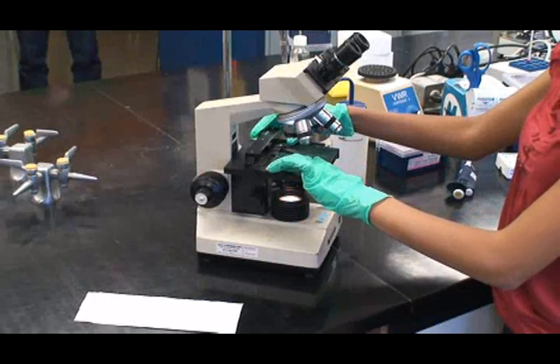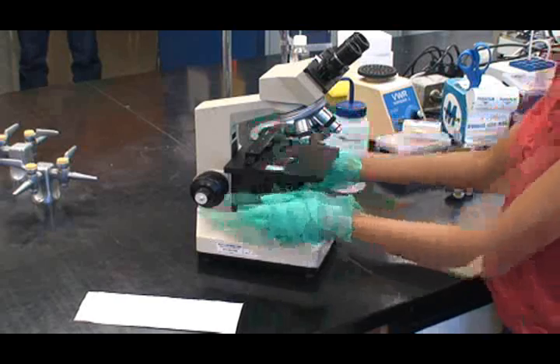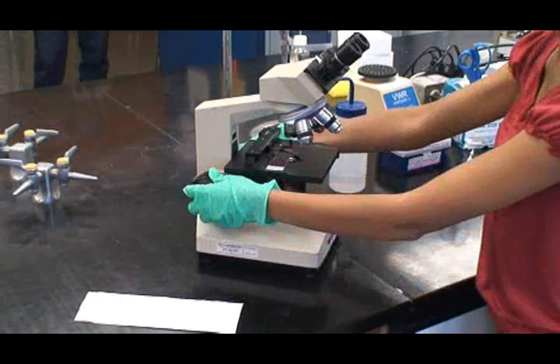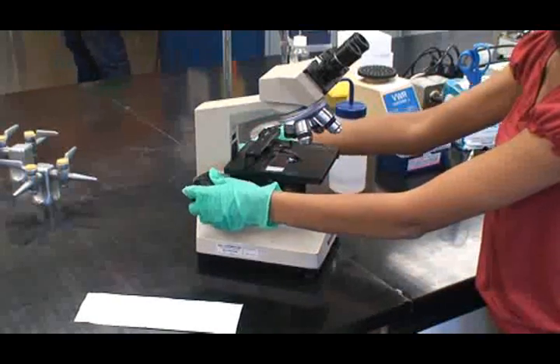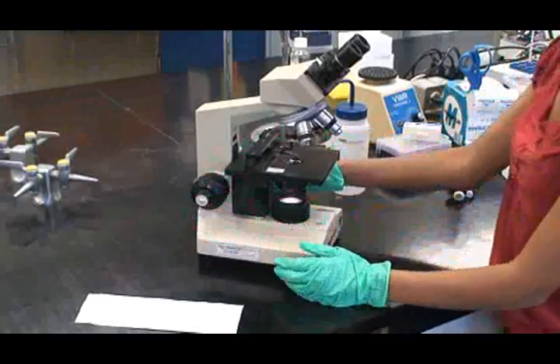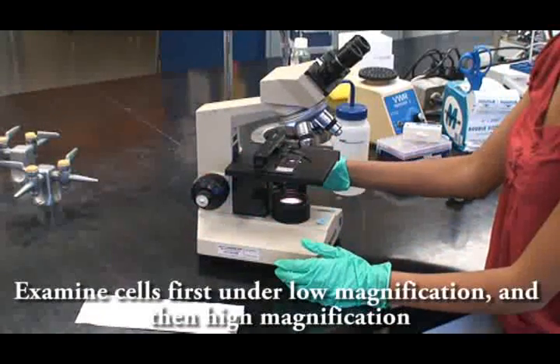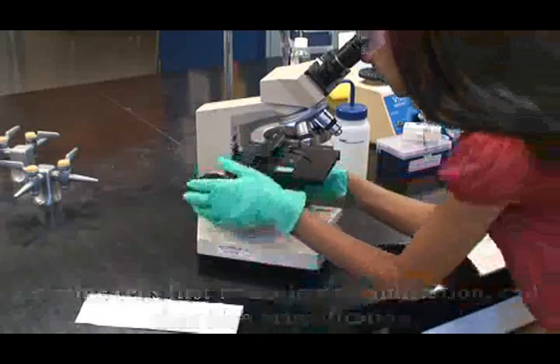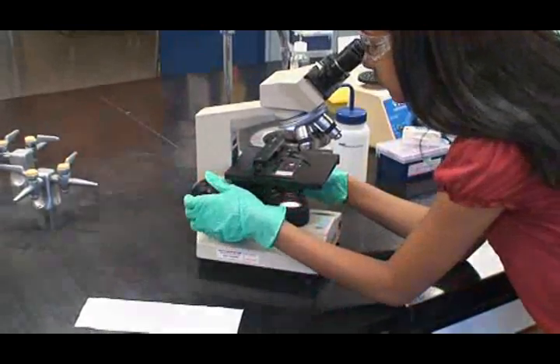Examine your cells under low and then higher magnification. If you cannot find cells, the cells may be clumped, so scan the slide to find the cells that have floated free.